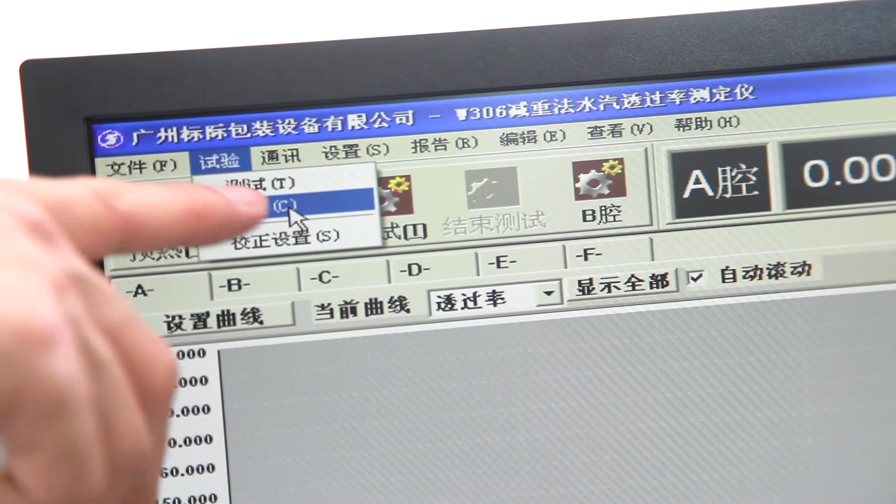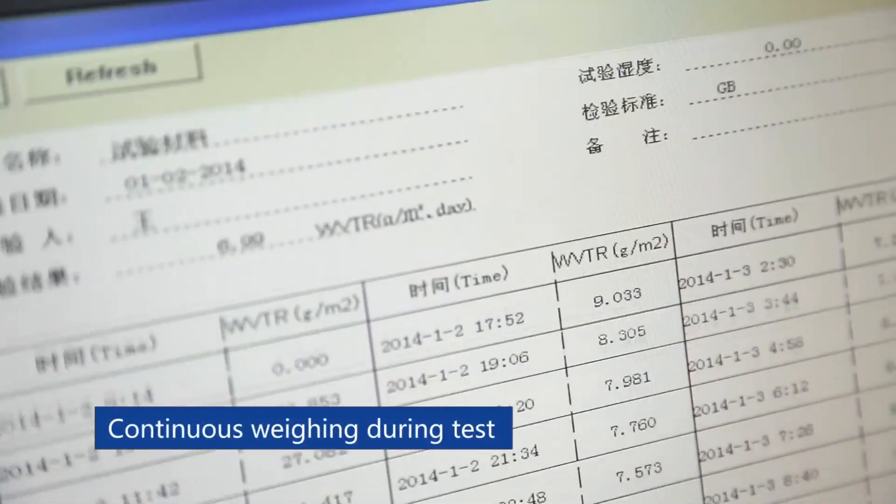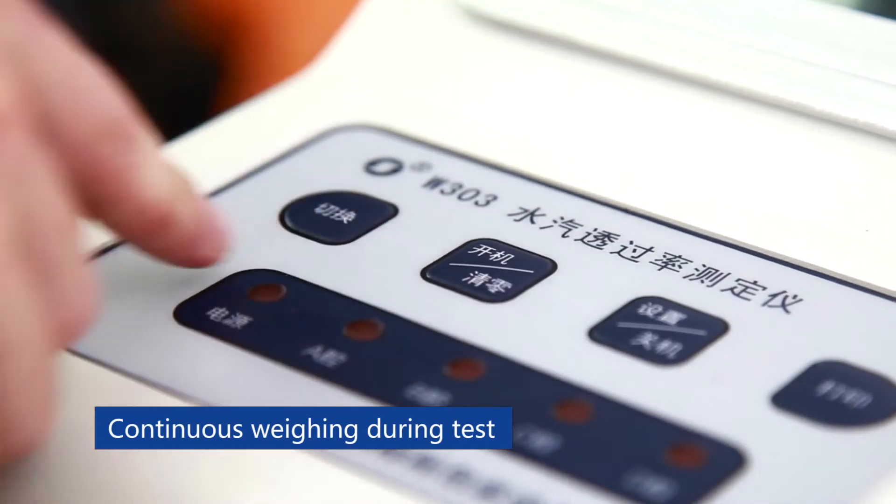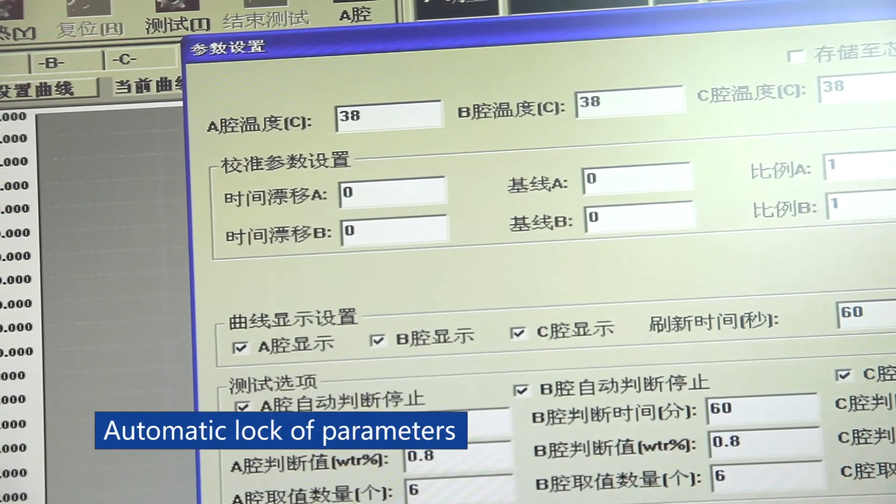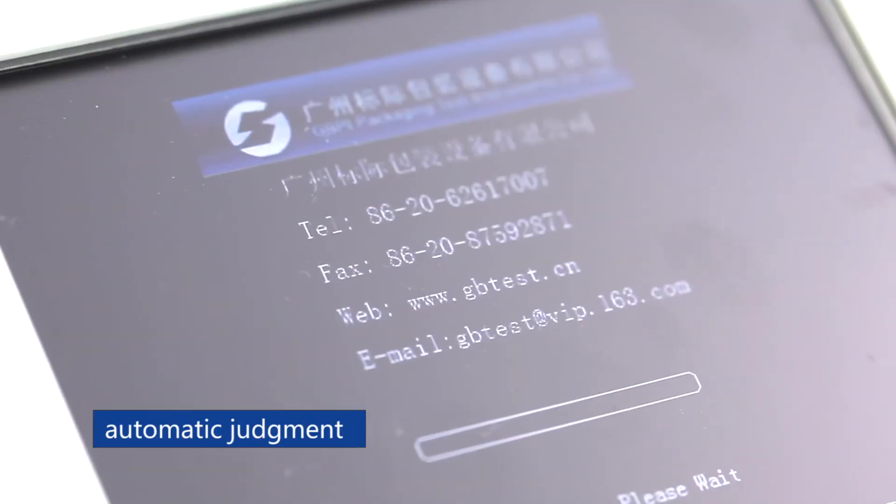Automatic correction of wrong parameters. Continuous weighing during test. Automatic lock-up parameters. Automatic judgment. Automatic stop.